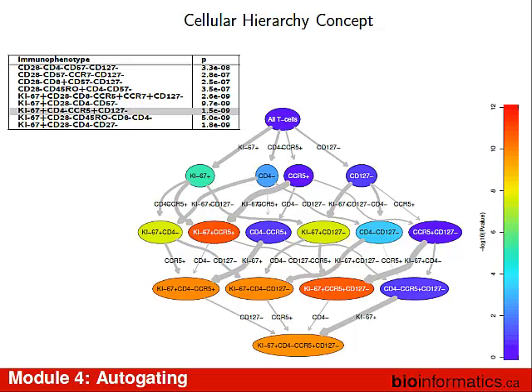Here's this population that we found that's very significantly associated with the ability to distinguish between the two. But when we laid it out in this way for this one particular population, we see higher up in the hierarchy, there's a population that requires fewer markers. And because it requires fewer markers, it's also a bigger population, a larger proportion. This is kind of interesting. The thickness of these arrows is how much the p-value is changing when you've gone from a population to adding the next one. That population is decreased a lot when you go to here. Decreased p-value, gotten better.